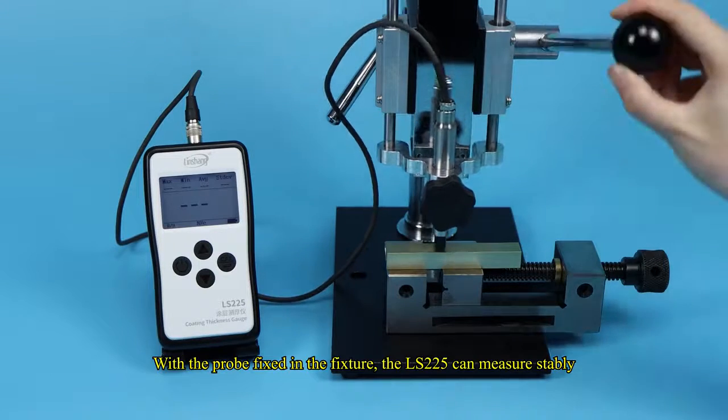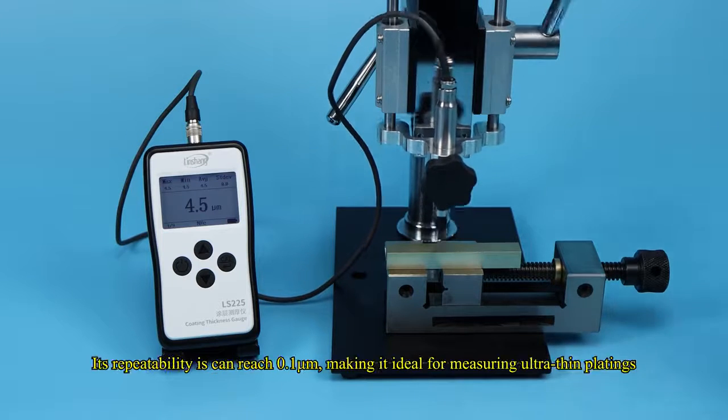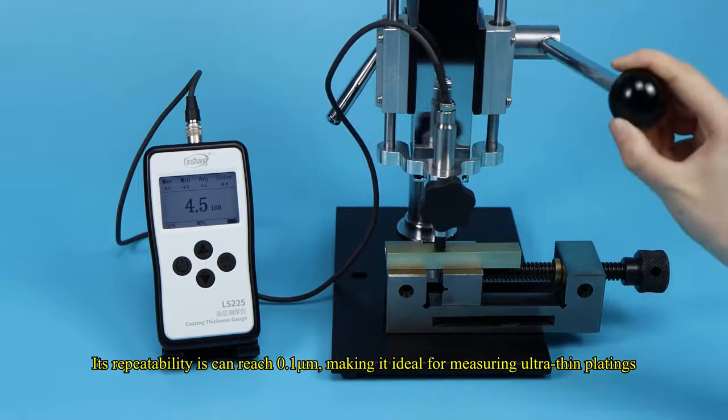With the probe fixed in the fixture, the LS-225 can measure stably. Its repeatability can reach 0.1 micrometers, making it ideal for measuring ultra-thin platings.